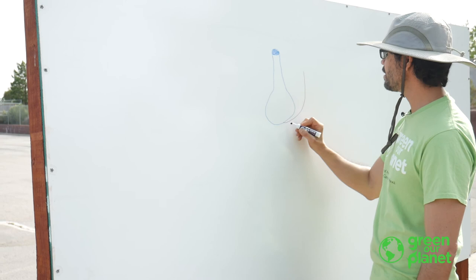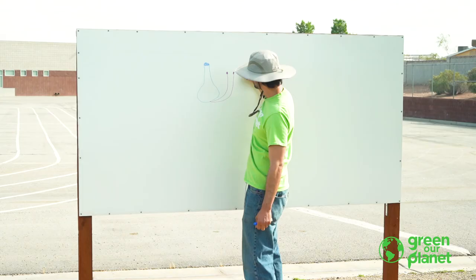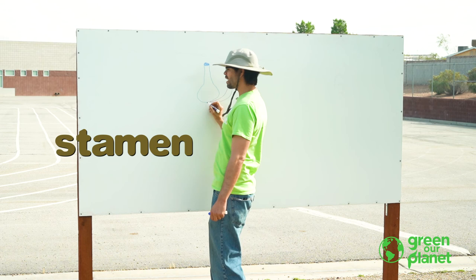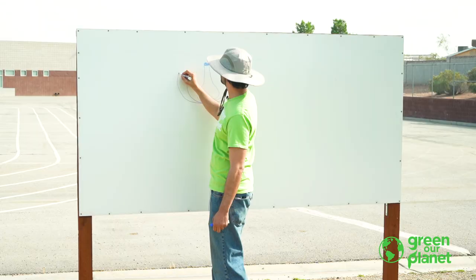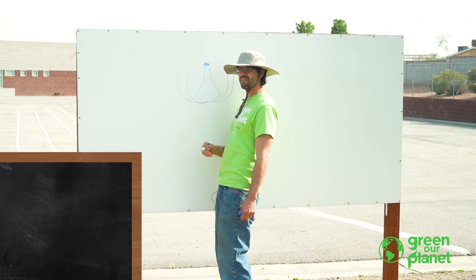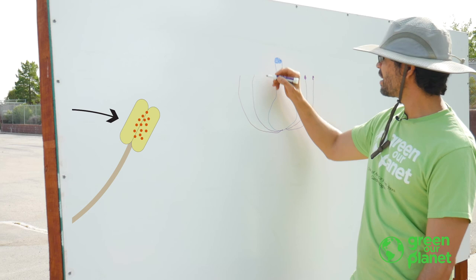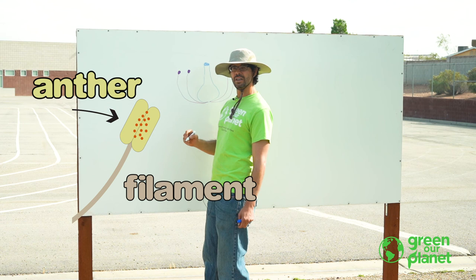The next part is these guys right here. They kind of look like little wires with a little fuzzy dot on top. These guys are called stamen. Here's one stamen, there's another stamen, and there's another stamen on the other side — two stamens on each side. Some flowers have four stamens, sometimes five or six. Flowers are all different, but the stamens always look the same. This little wire part is called a filament, and on top of the filament, these little fuzzy dots are called anthers.